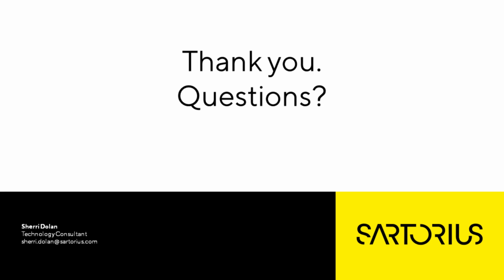That's a good one, yeah. So we do have an integrity test for these devices. And yes, we recommend that you perform a pre-use integrity test, especially on the Pico device. Now, the Pico device, due to its design, it's sensitive to pressure pulses. So I think a pressure pulse of greater than 80 some PSI can actually damage the Pico device. It's a little more sensitive than the Nano.